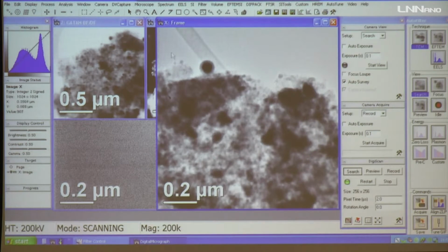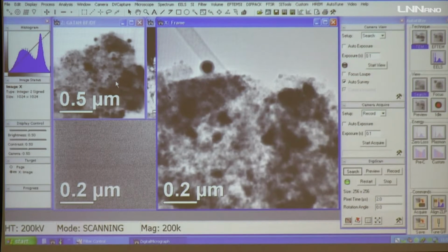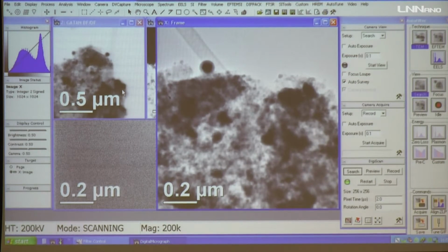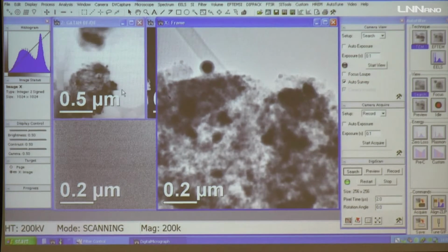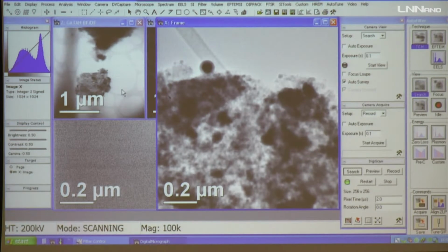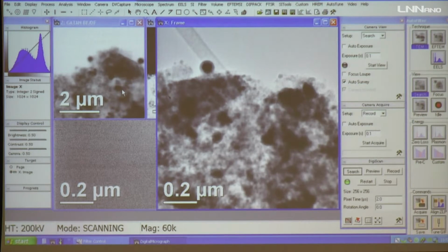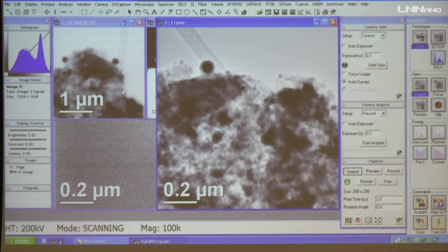Now it's interesting to compare the two viewings of the material that we may have. I guess this is the same part of the material. I'm not sure. I guess this guy here is this guy here. You agree? Yes or not?